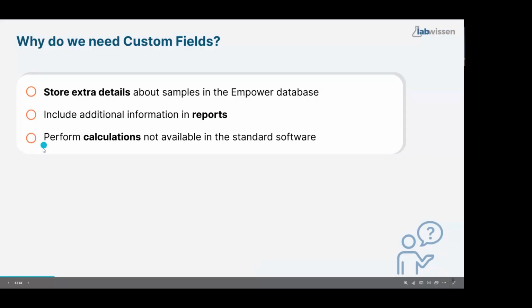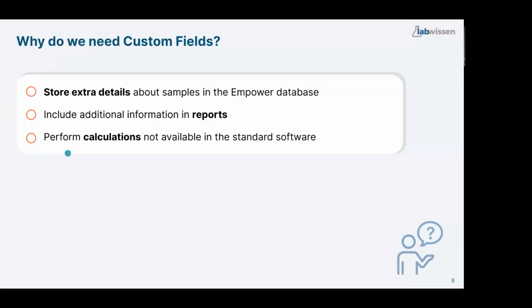And the last, and I think the most important one here, you can perform calculations not available in the standard software. So when you're good in custom fields, you can skip Excel, you do all custom calculations in Empower, and your calculations will be automated, and it works great.